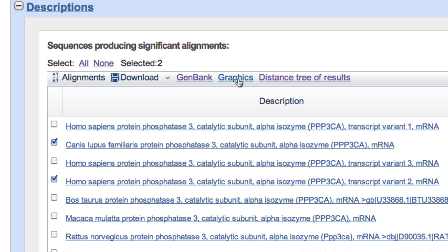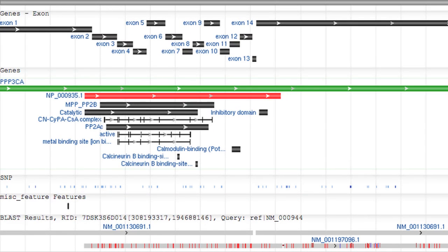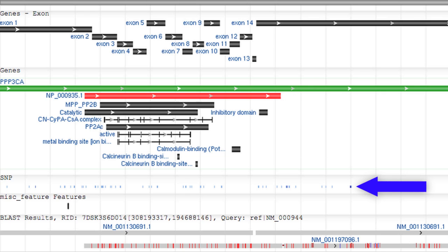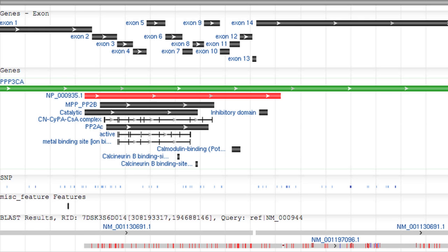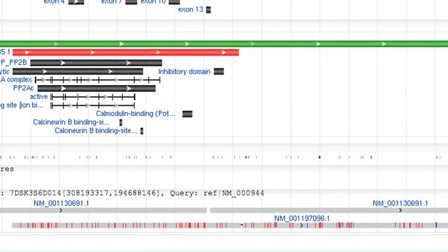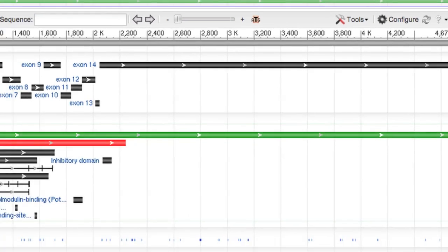The graphics link takes you to a sequence viewer display of the alignment that may include known features on the query, such as the exon structure, protein product, and SNPs. The alignments are represented here. You will only see such features when using an NCBI accession or GI identifier as your query, particularly RefSeq identifiers. Use the help icon to access sequence viewer help, including video tutorials.